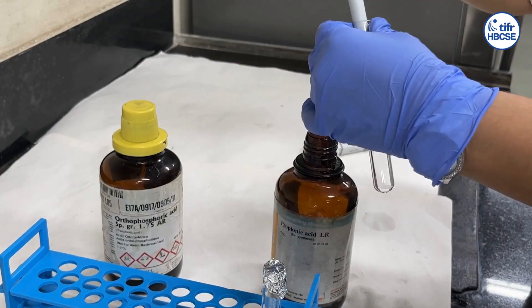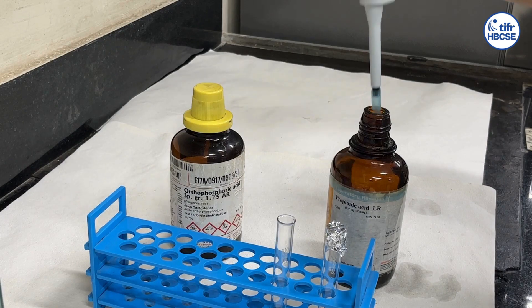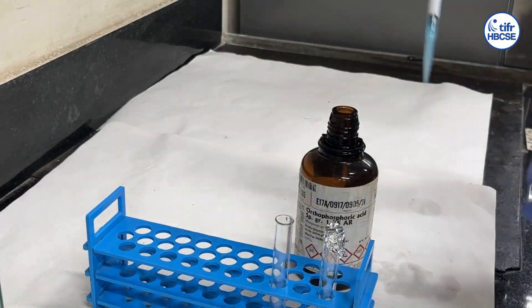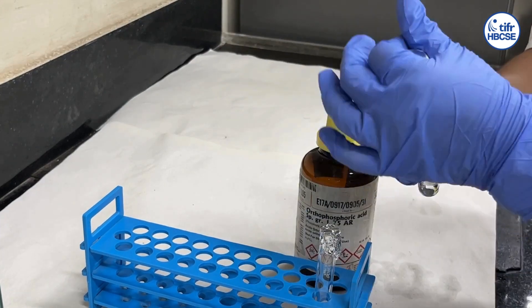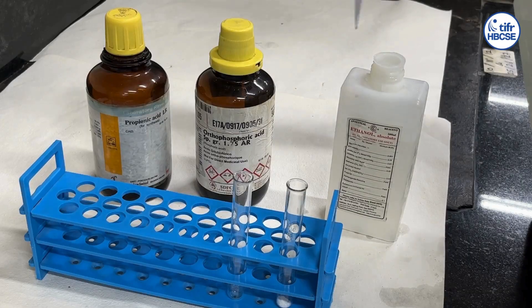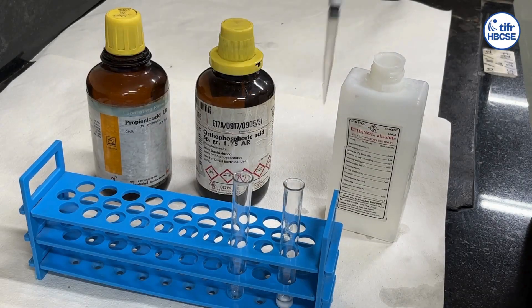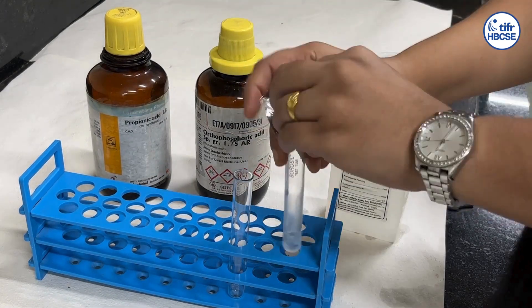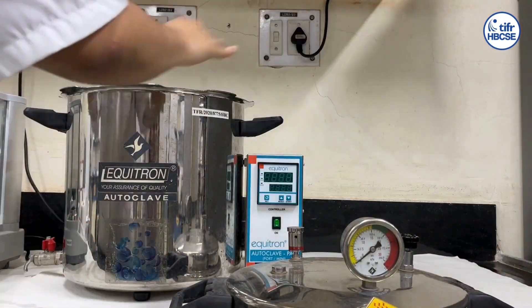Meanwhile, mix propionic acid and orthophosphoric acid in a test tube and cover the mouth of the tube with aluminium foil. In another tube, dissolve methyl hydroxybenzoate in ethanol and cover the mouth of the tube with aluminium foil.